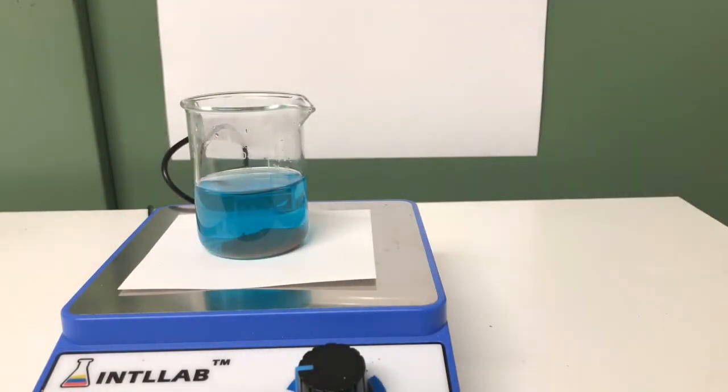Copper sulfate reacts with iron powder to form elemental copper and iron sulfate.